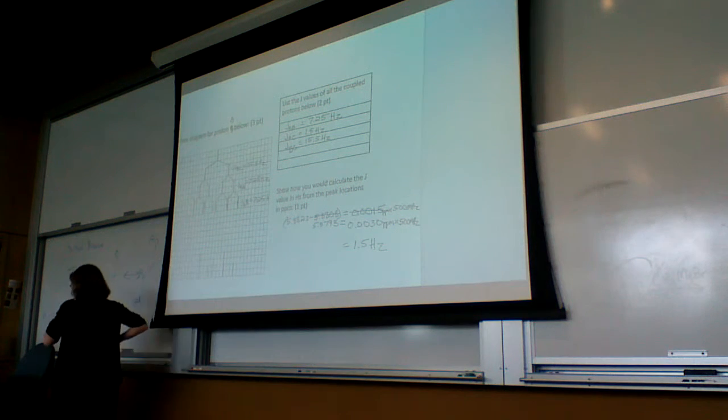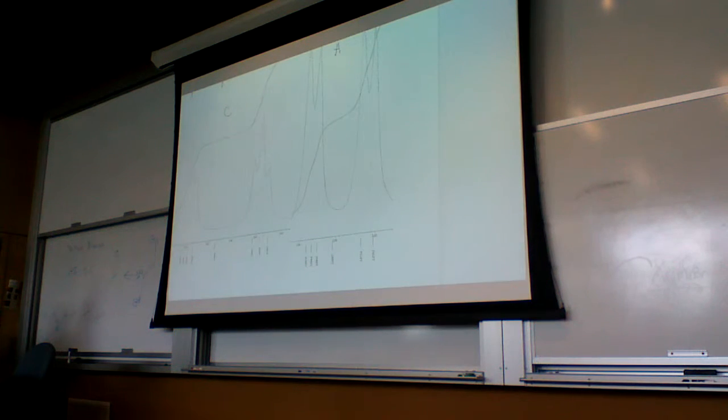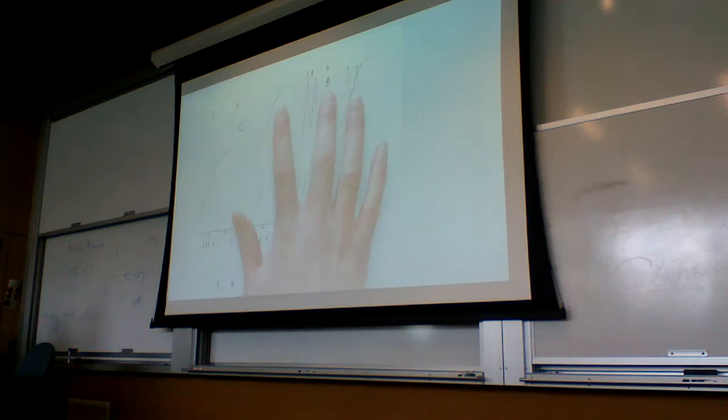Yeah. So when I was writing this out, I labeled these on the back as which ones they were. And everybody else got a version of that. So when I labeled these, I have A and C and B. So between A and C, these two peaks, the common number between the two is 1.5. And so that tells me that the JAC value is 1.5.